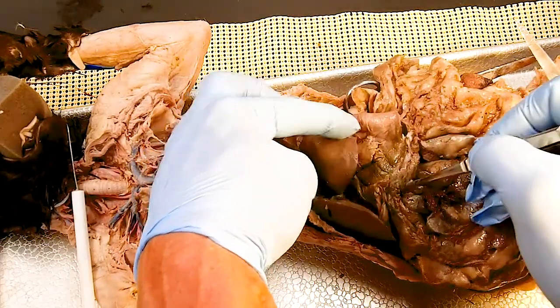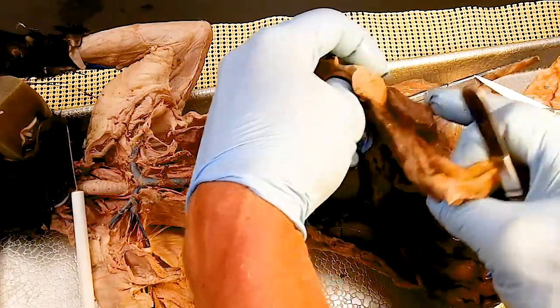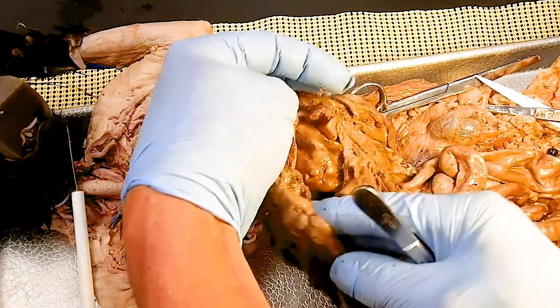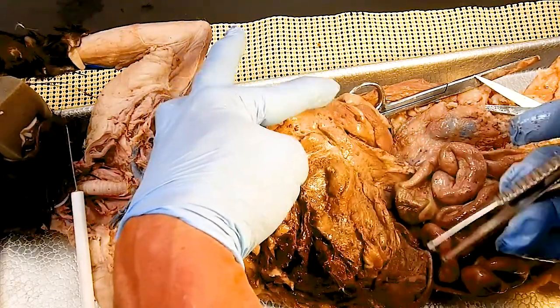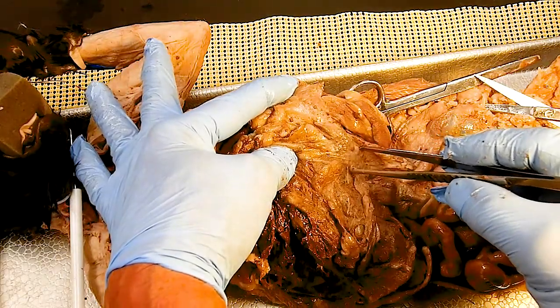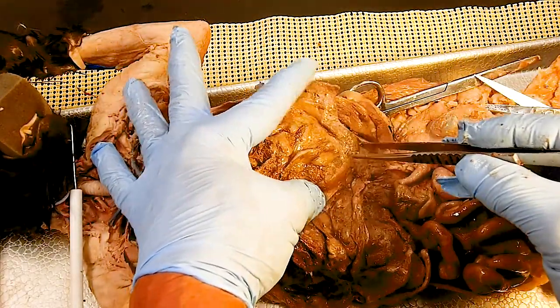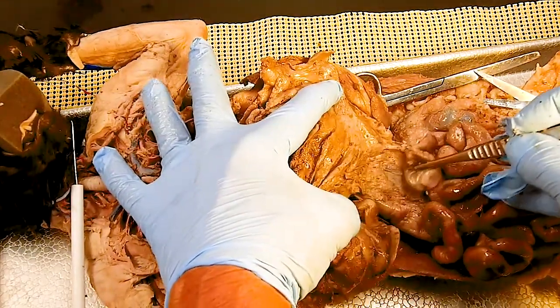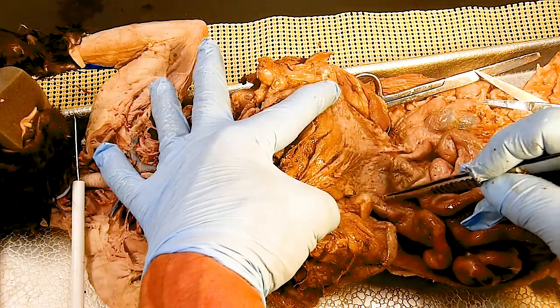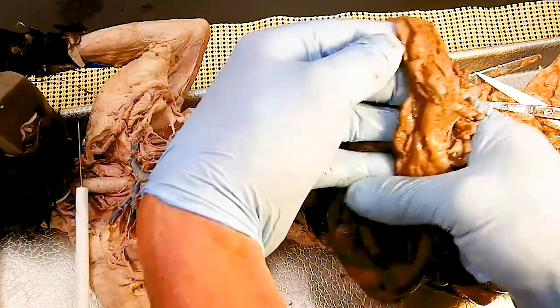So we already got the liver and gallbladder. Now, the other thing you can do, take this greater omentum, that's the spleen, you can see that dark colored organ there. If we lift all of this up, the pancreas is right here. Kind of looks like pale hamburger meat on these preserved specimens. It's running right behind the stomach. See a bit of it here, kind of runs down here. And it'll actually go to the small intestine, which is here. And on the cat, it follows it down a wee bit. So this is all pancreas here. Kind of lift up the greater omentum and stomach to see it.